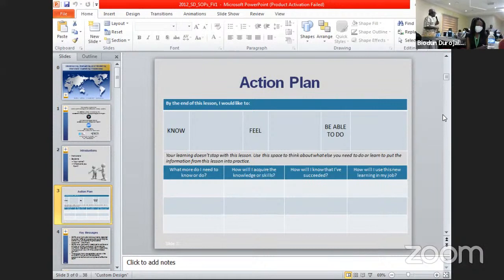Group two. SOPs are generally designed to achieve a single or small outcome. For example, correctly disposing of laboratory waste. For example, what should I do with this contaminated glove?